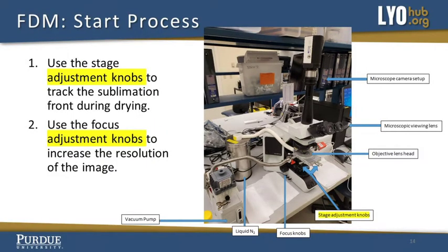Use the stage adjustment knobs to track the sublimation front during drying. Use the focus adjustment knobs to increase the resolution of the image.